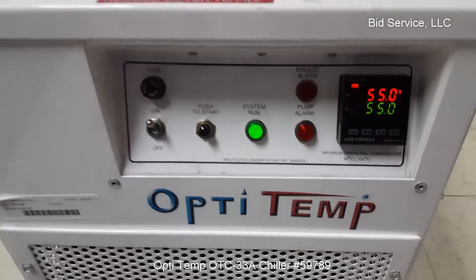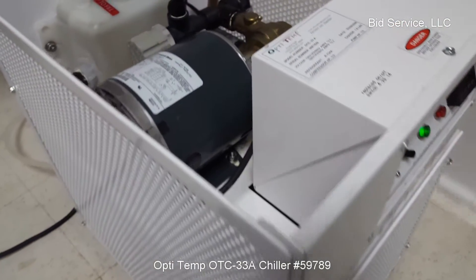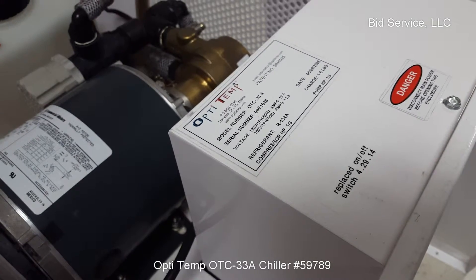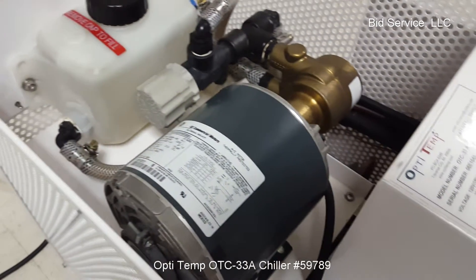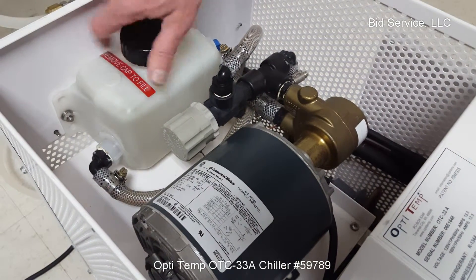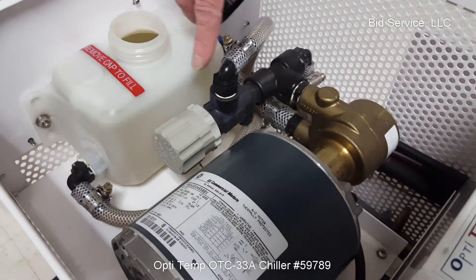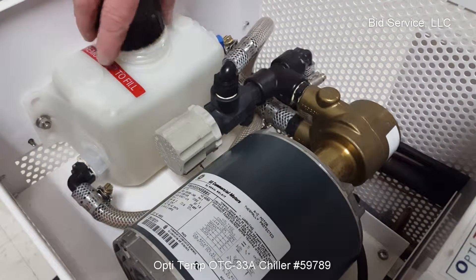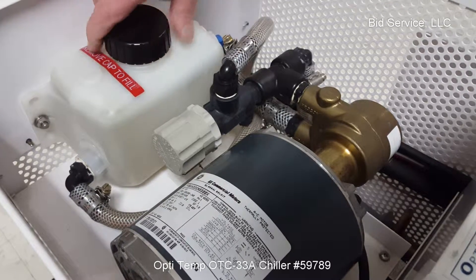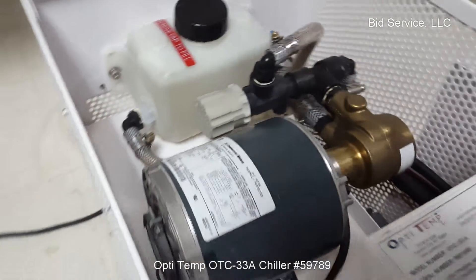We'll take a quick look inside — just lift the cover off here. Here's the reservoir. To fill the system, just take the cap off and fill the reservoir. There's a float inside, and you also have a thermocouple inside between the temperature sensor and the reservoir. There's a bypass valve here that you can adjust, and here's your Pocon pump.